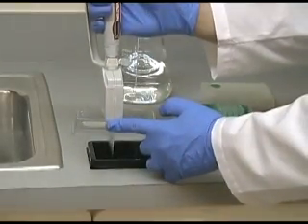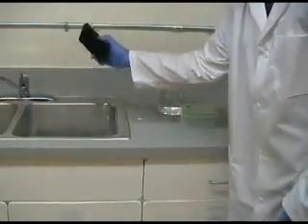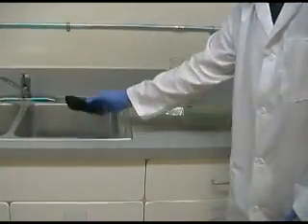Multi-channel pipetter washing. After each incubation, aggressively flick the sample out of the plate over a sink before starting the wash protocol.